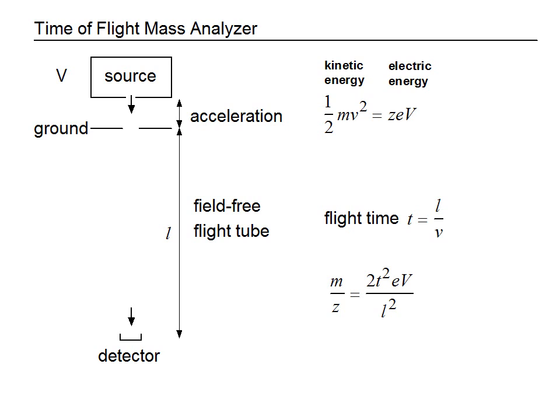If that is the case, ions will take a certain time to reach the detector. This time is called the time of flight. How is this time of flight now related to the mass-to-charge ratio? Take a look at the right side of this slide. Each ion acquires a certain kinetic energy based on the acceleration in the electric field.